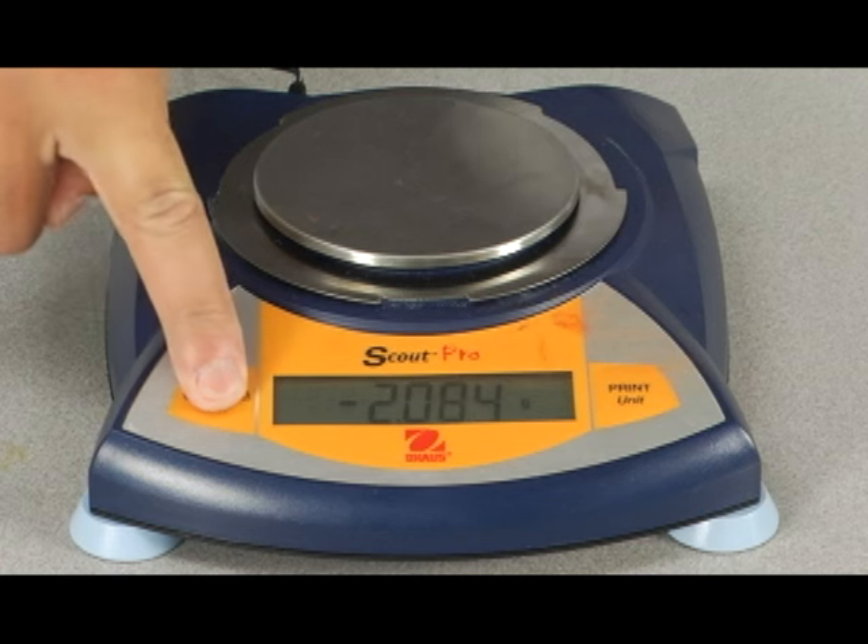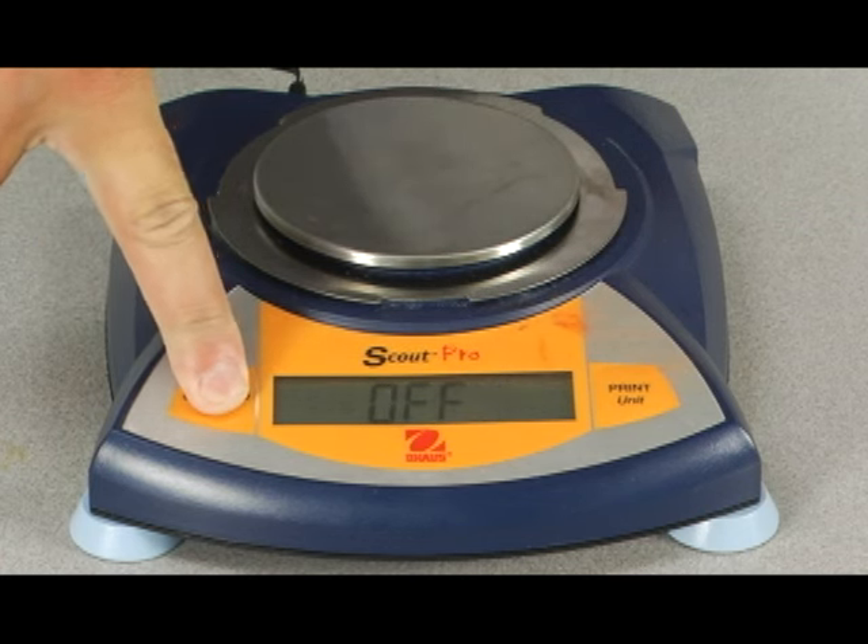To turn the scale off, just hold down the on/zero/off button until all the lights go off and it reads 'off'.